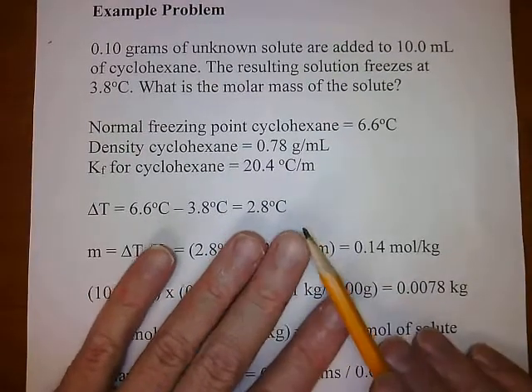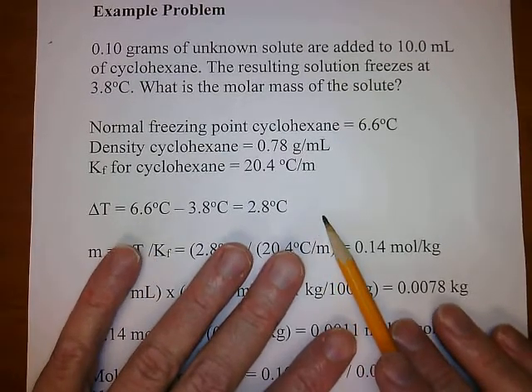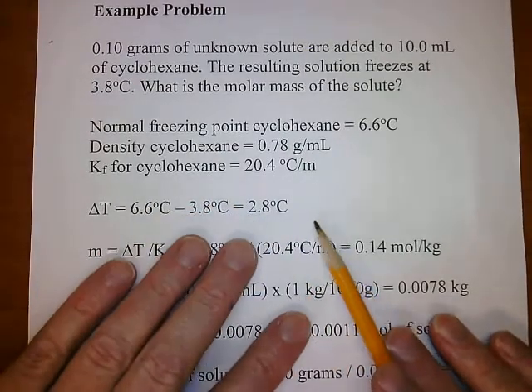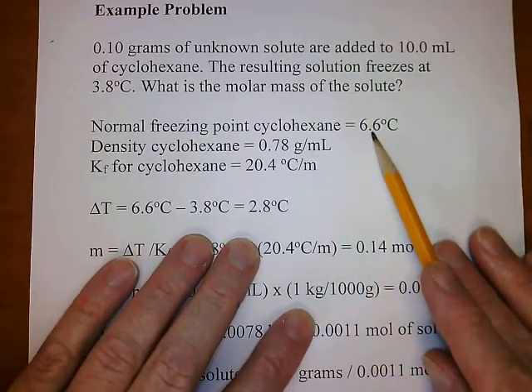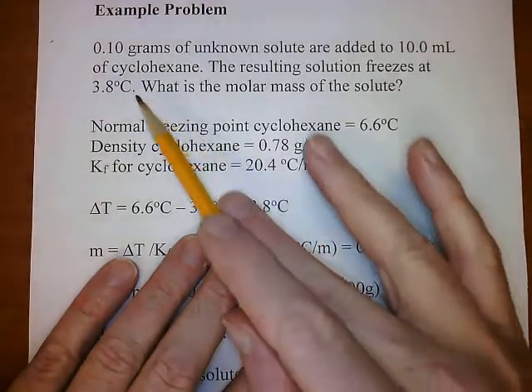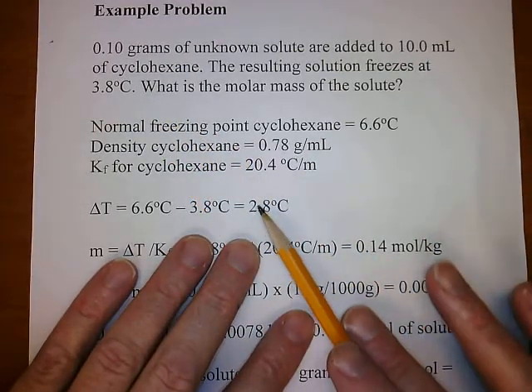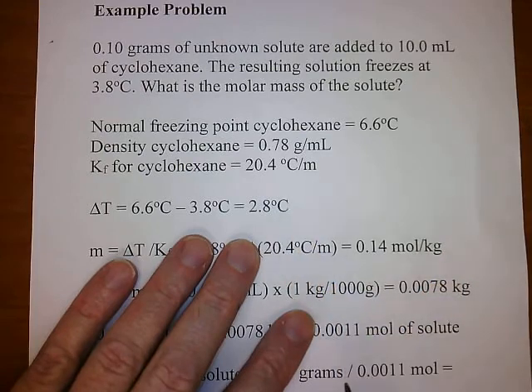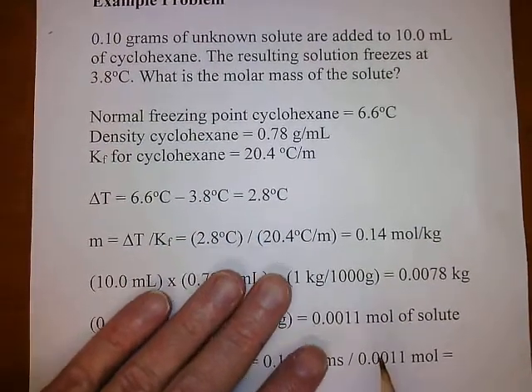So the first thing that we have to do is calculate the freezing point depression, the change in the freezing point. Cyclohexane normally freezes at 6.6. Our solution froze at 3.8. So that's a change of 2.8 Celsius.